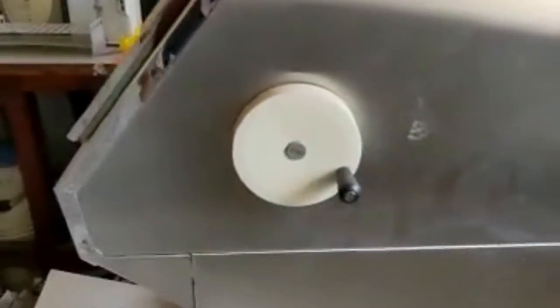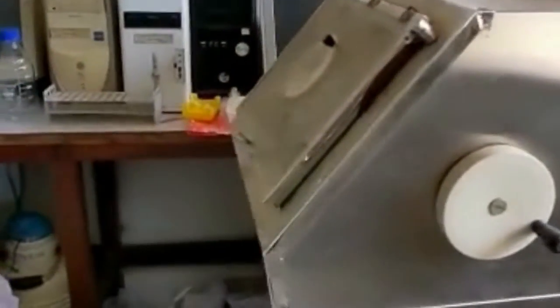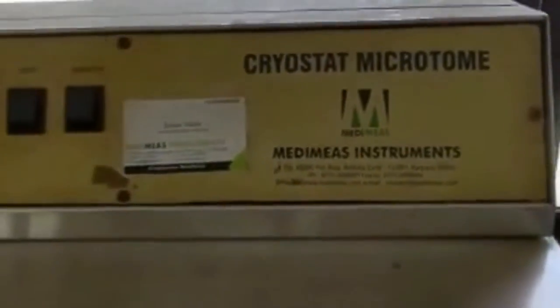Cryotomes are a specialized instrument composed of a tissue microtome as well as a cooling chamber that allows for rapid freezing of tissue and continuous process of cutting tissue at low temperatures. The cooling chamber of a cryostat has a work area to place chunks when cutting another section. Tissue is ideally cut when the chamber is between negative 10 to negative 20 degrees Celsius, depending on the tissue.